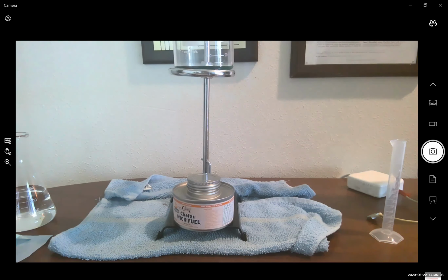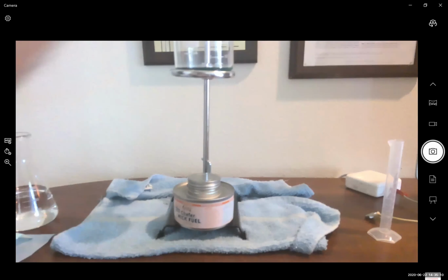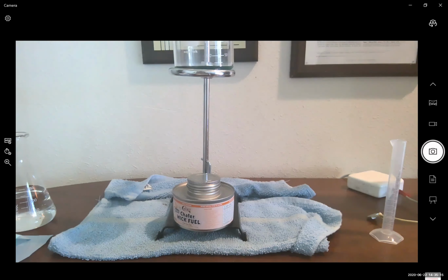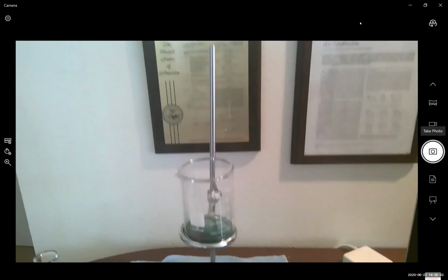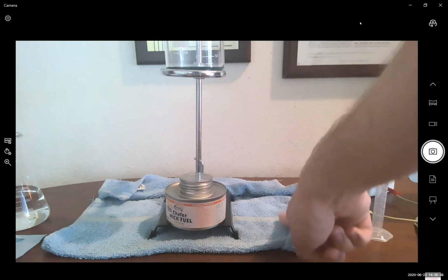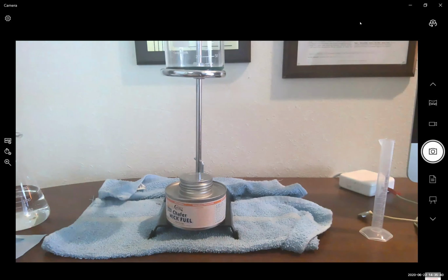Now, and this is important. This is why I had you get another towel, because this beaker is hot. You do not want to put hot glassware on a cold surface. So we're going to use our towel and grab the top of our beaker. The top of our beaker is the coolest part of our beaker. So we're going to use our towel to grab the top of our beaker and place it on our insulated surface.